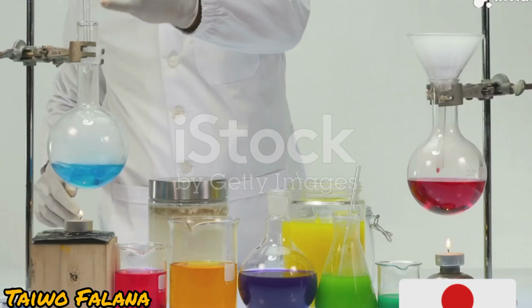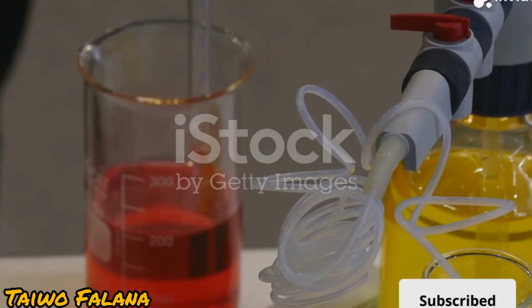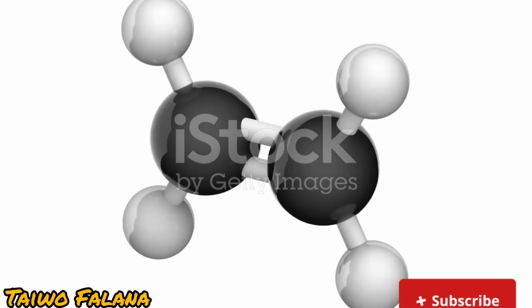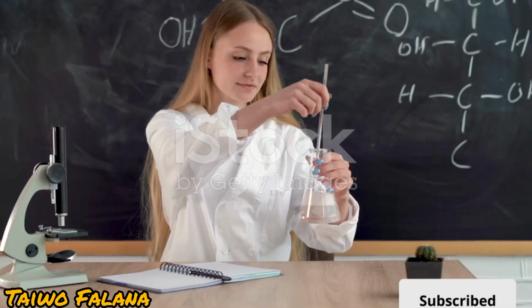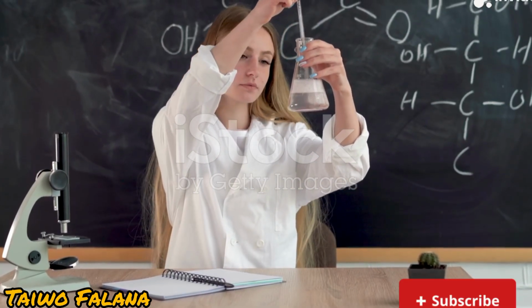Hey, welcome back! Today I'm breaking down how to prepare two super important gases in chemistry: carbon dioxide, also known as carbon(IV) oxide, and carbon monoxide, or carbon(II) oxide. Whether you're prepping for your KCSE or just curious about how these gases work, let's dive in.